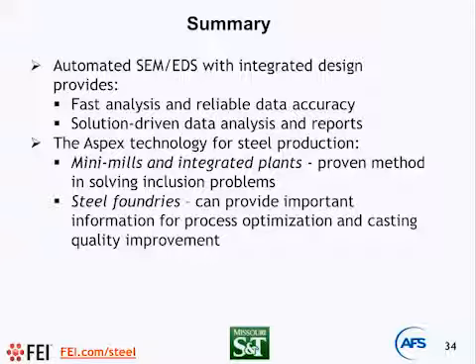Sometimes in the optical microscope we observe specific areas, and we go to the SEM to look at what's going on in that area, because sometimes inclusions could affect the microstructure. For example, after specific heat treatment, like ausferrite, the kinetics of this reaction significantly depend on inclusion composition. So first we look at the optical microscope, then at the scanning electron microscope, and then we verify what's going on with the properties of the material. So I will use both, is my answer.